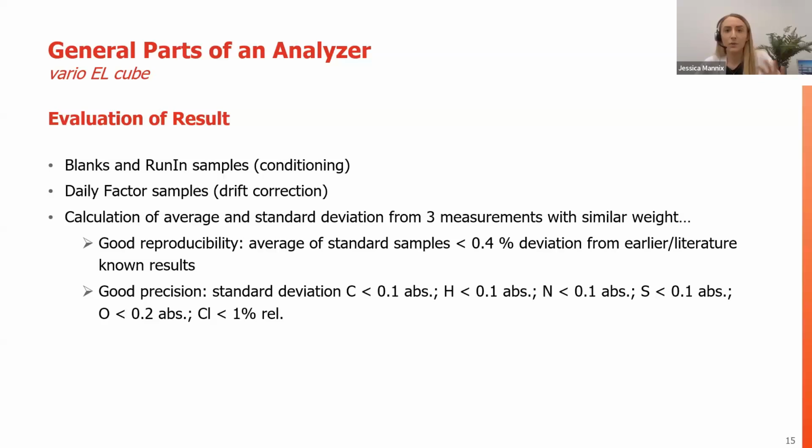In order to evaluate our result, we want to make sure that the instrument is functioning well, both in terms of its overall hardware and service, but also for the application. What we'll typically do is start the day by running blanks just to purge the instrument, making sure that there's no residual analytes stuck in any of those columns or any atmosphere that may have entered the instrument. Then we'll follow by running conditioning samples. We here at Elementar call them run-in samples, but to be specific, conditioning also works here, just to prep the analyzer to receive something other than a blank.